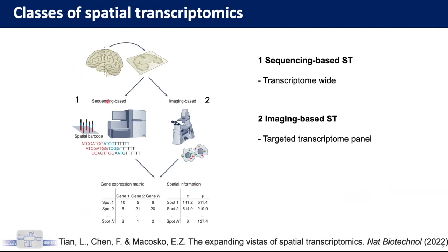Typically, the sequencing-based technologies are not at a molecular resolution. Some of them can be at subcellular resolution, but the only molecular resolution technologies, all of those are imaging based, including MERFISH.